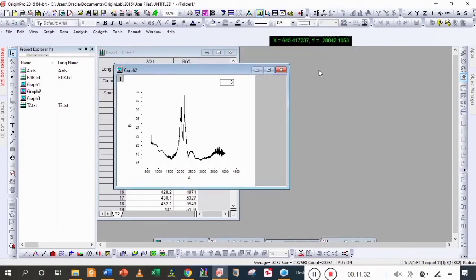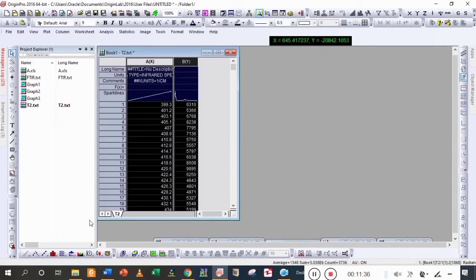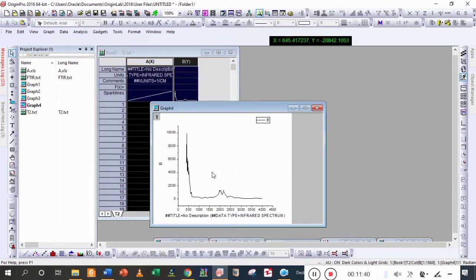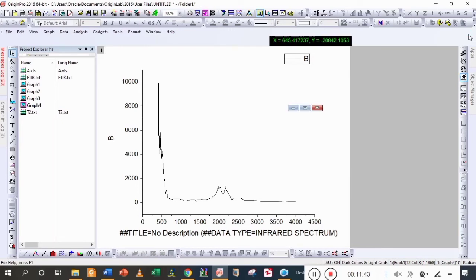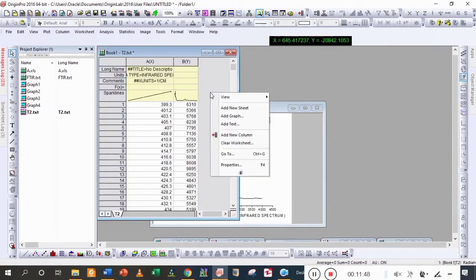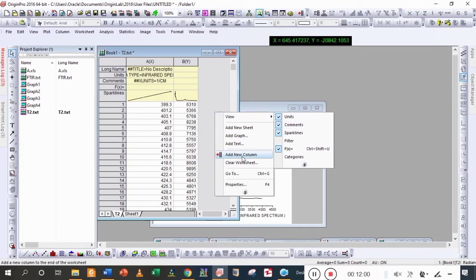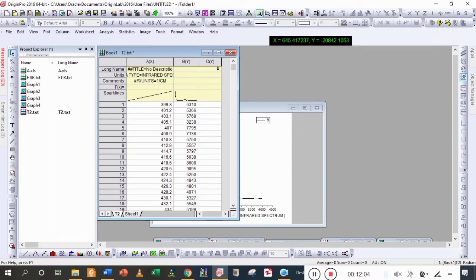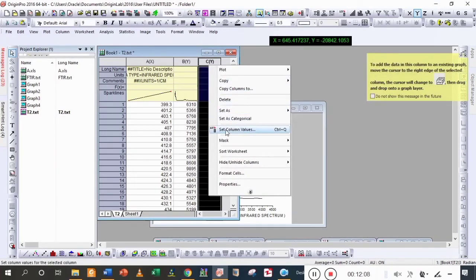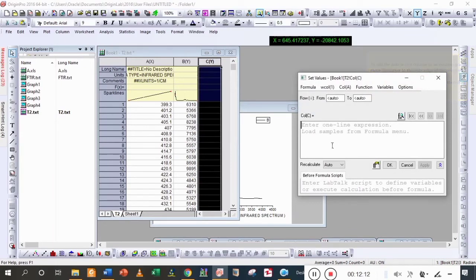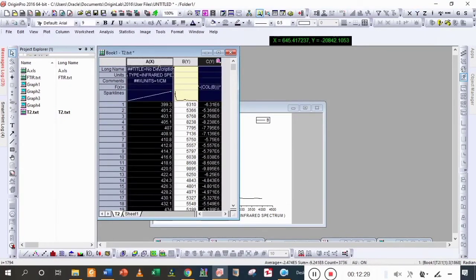Now we are going to deal with the third graph. You can see that it is absorbance data, so we are going to change it into transmittance. Again Ctrl+D — add a new column. Select all, then set column value. Write the formula in f(x): 10 to the power of minus column B intensity value, then multiply by 100, and here we get the transmittance values.